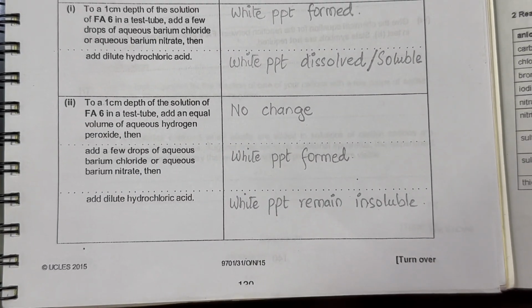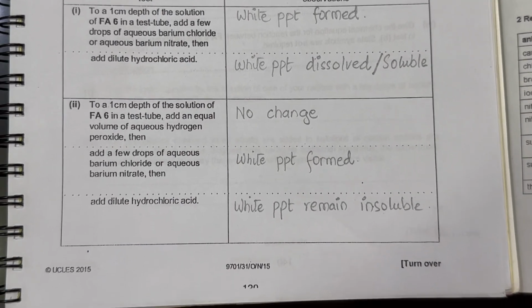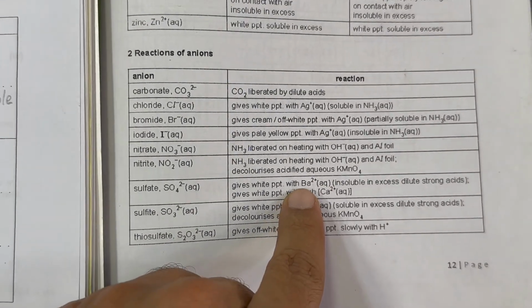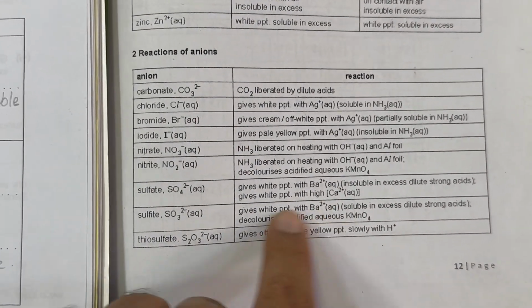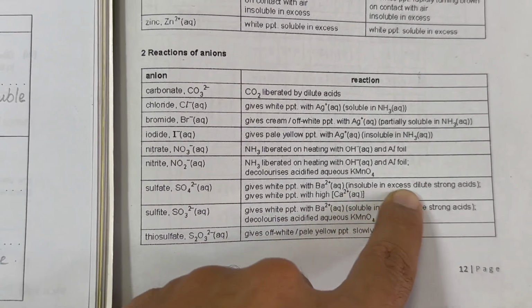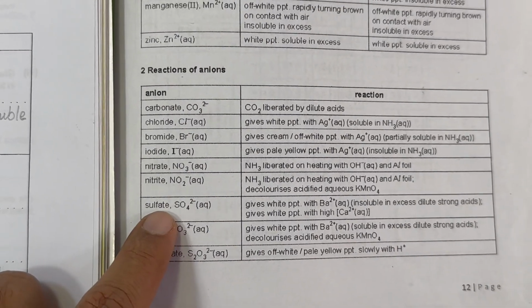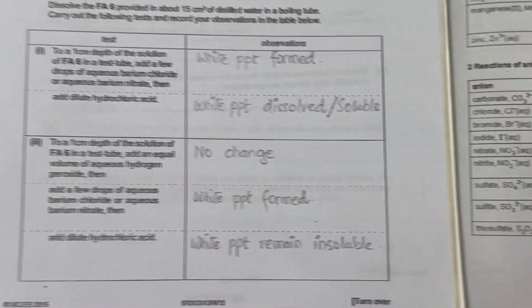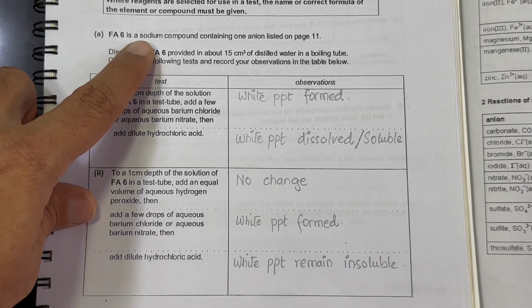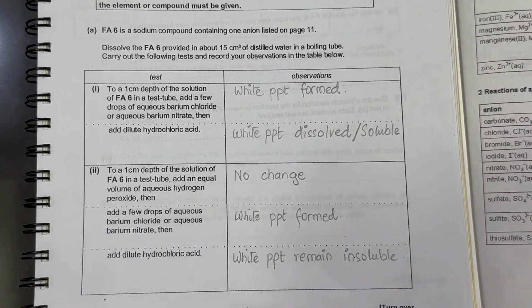So we have recorded all this information here, and now we can see again, after adding barium chloride or barium nitrate, if white precipitates are formed and they become insoluble in acid, it means sulfate is confirmed. From here we can conclude that our Fa6, which was a sodium compound, basically had the anion sulfite.